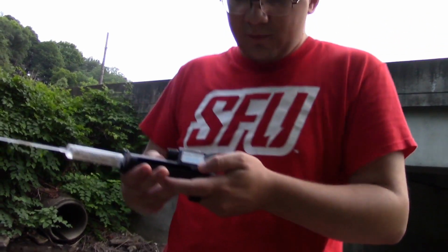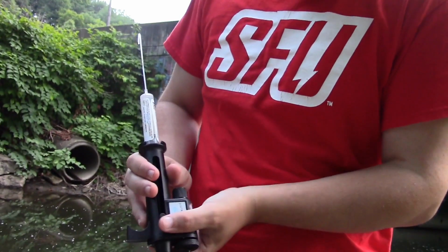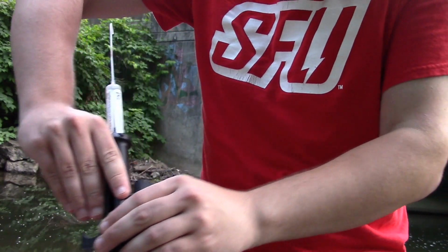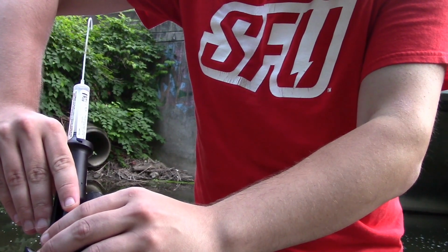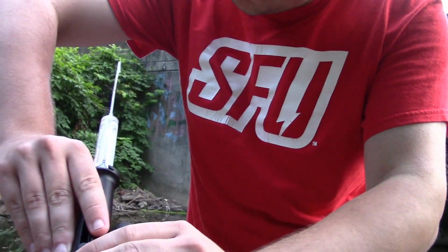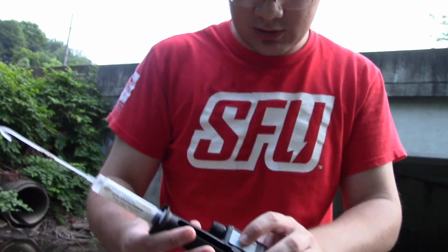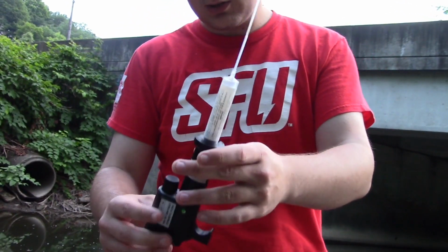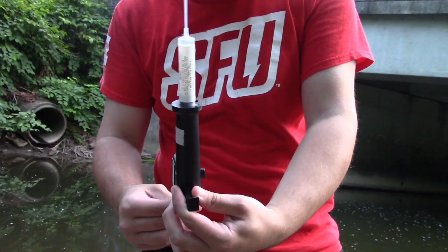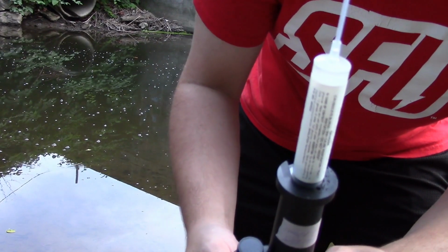So, being very careful here, let me push this plunger in so it's at the end. This is a fresh cartridge, so I'm going to have to be very careful here because it's probably going to squirt some acid out as I press this up. There we go. See, now we know that it's filled up with some acid, and just to make sure, as you can see there's a couple drops there, I'm going to turn this dial a little bit until I can see a drop coming out of the end. There, did you see that?